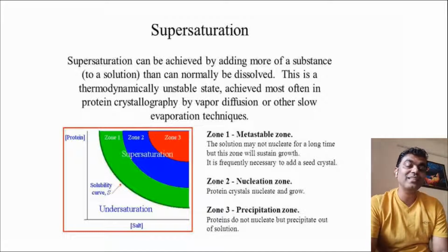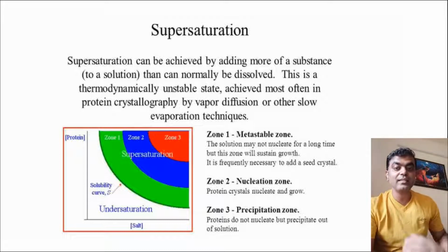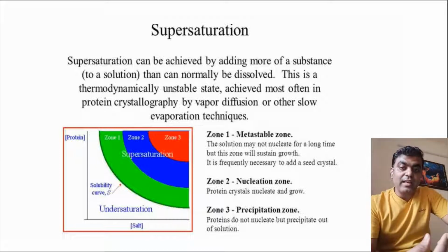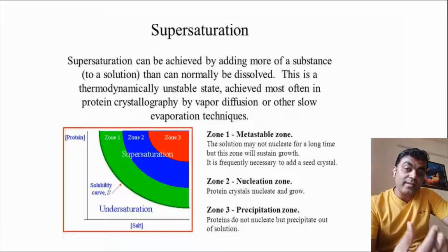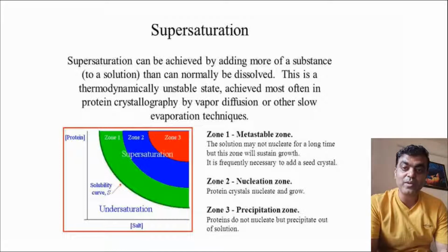Now why is this important? Because at that stage the entire mixture, the solvent along with the salt mixture, becomes thermodynamically unstable. And once it becomes thermodynamically unstable, the crystallization process will start or initiate. And that is the most important phenomenon.